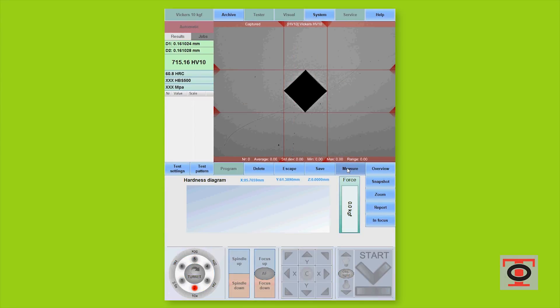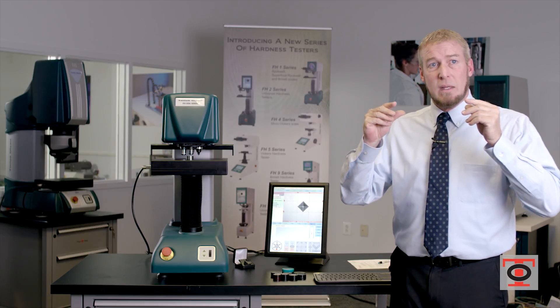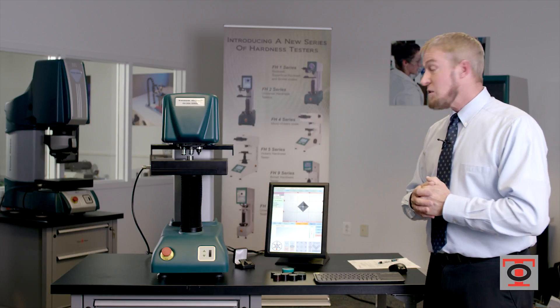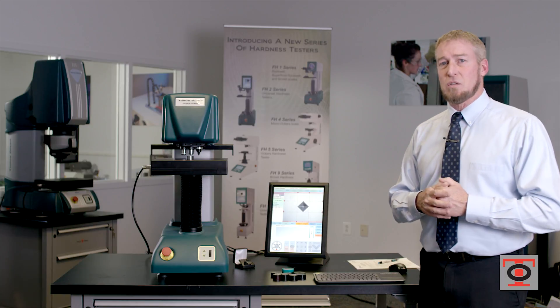You'll see that there are filar lines that pop up. We're probably familiar with filar lines because that's a common usage for measuring indentations. But when you're using a microscope, you're adjusting these by hand. Instead of doing that by hand, you now see that they populated on the screen — all I did was hit the word 'measure.' This is a manual function that I'm showing you, but later on we're going to see the automatic function.